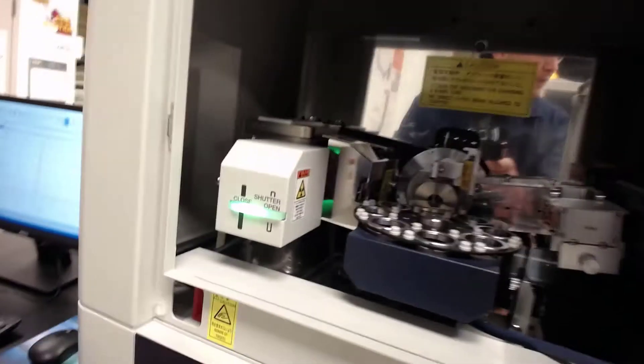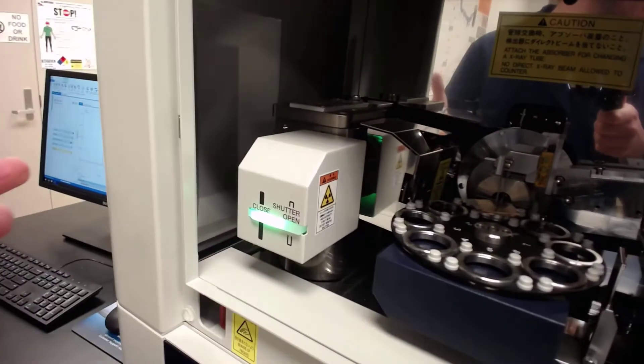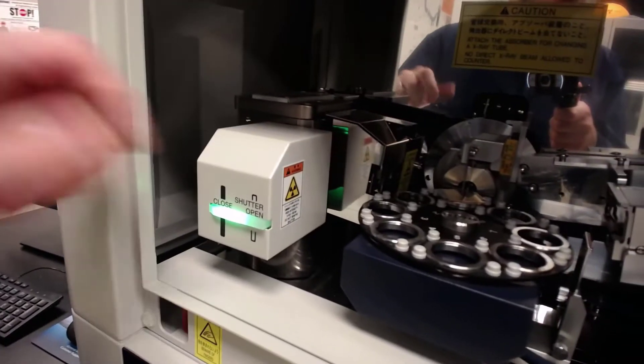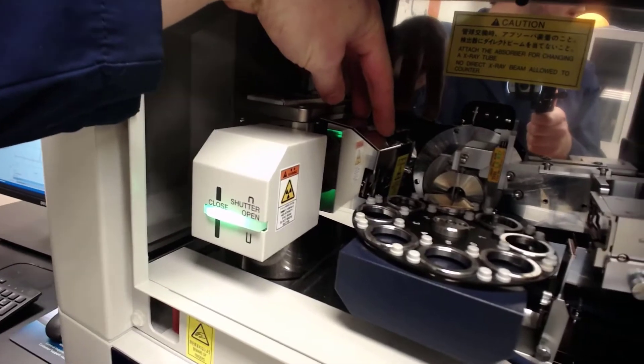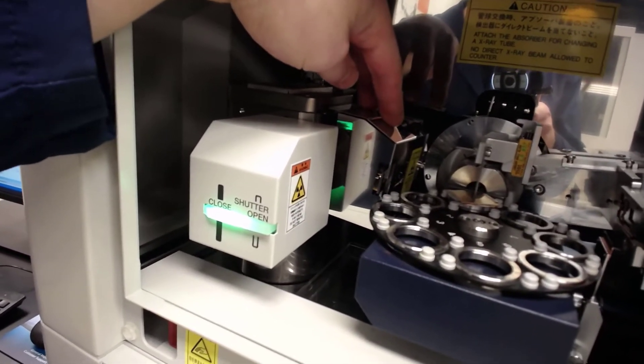Looking inside the system itself, we have our X-ray tube over here on the left. There's nothing really to see there, just so you know where the source is. There's a number of slits that are built into the system that constrain the size of the X-ray beam.